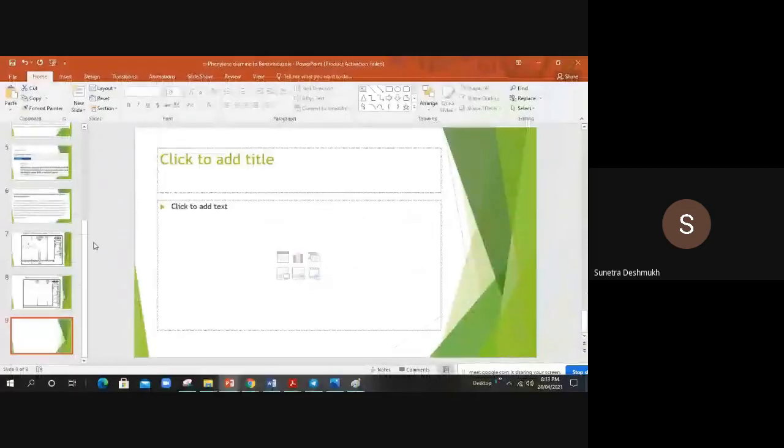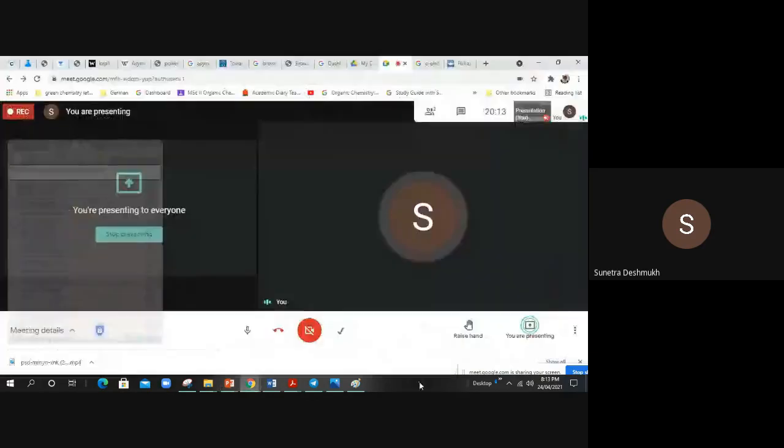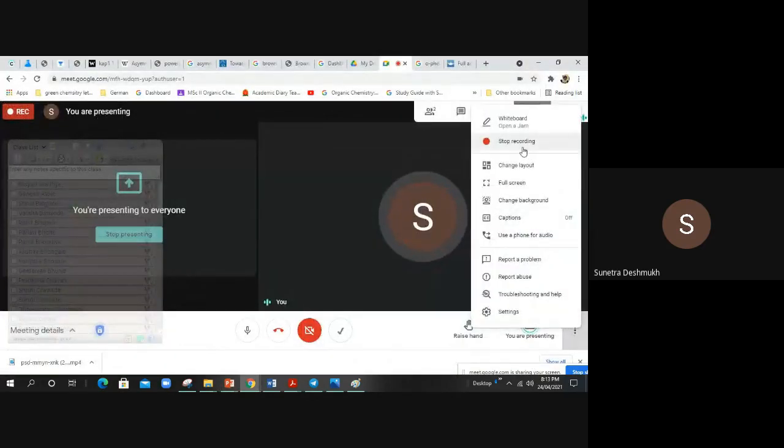You have to write your observations or your readings in the result table, so you know how to write the result table. So in this way we will stop here, and we'll finish this benzimidazole synthesis.